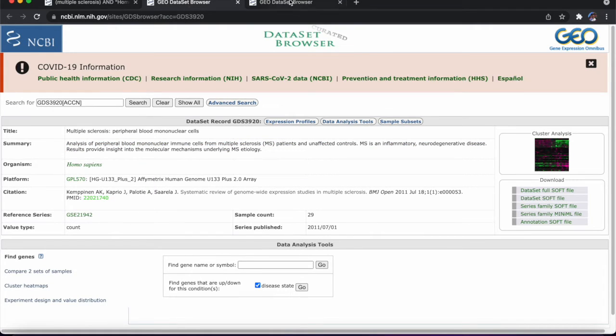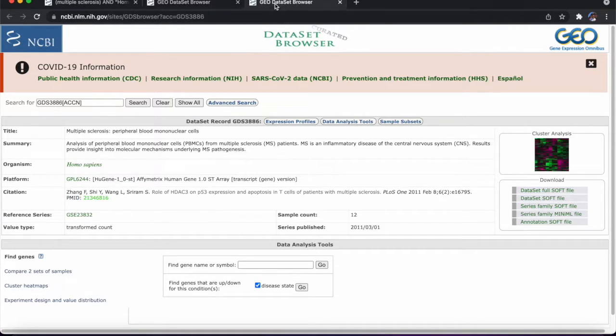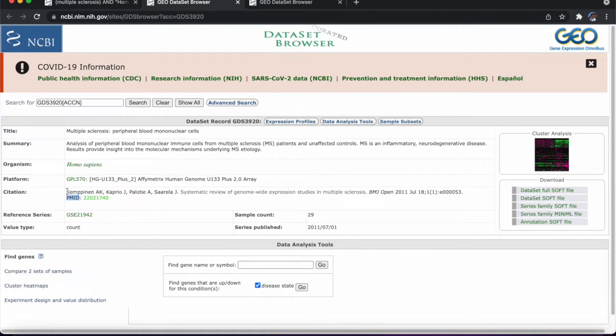So in cases like this, and there are bound to be cases like this where it seems like there are two datasets with the exact same information, NCBI and the Omnibus have to have a citation, right? That's where they got this data from. And what's great about this is it has a link to the exact article where they published their data, where these researchers, I'm not going to try and pronounce their names, have actually released their study.